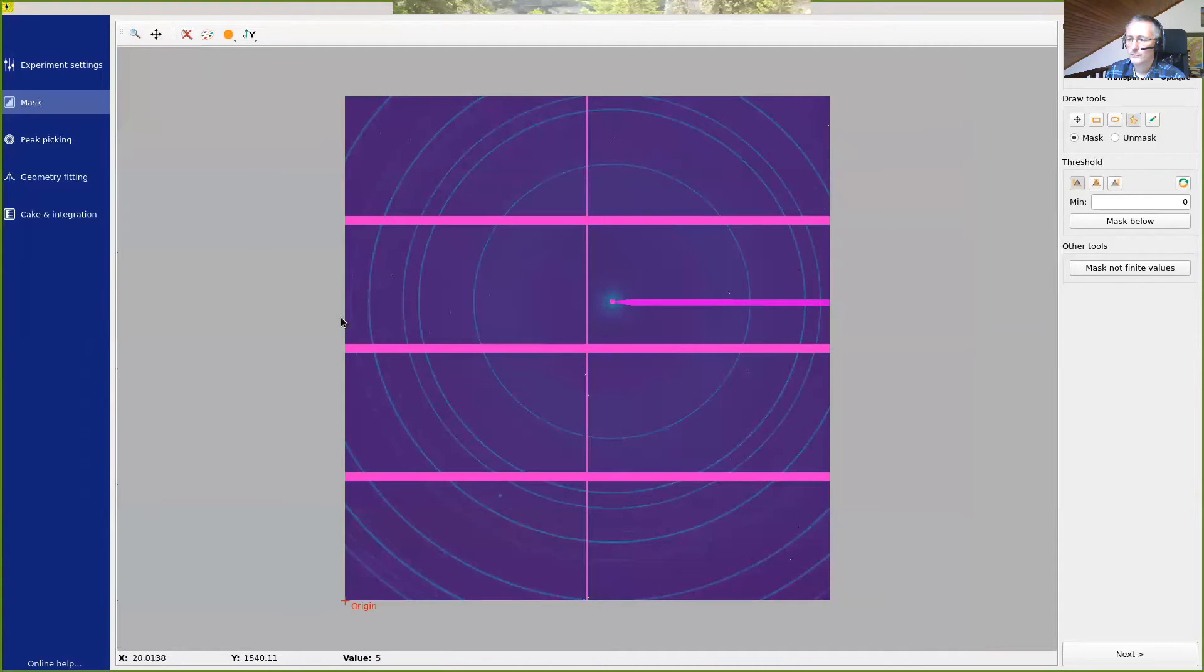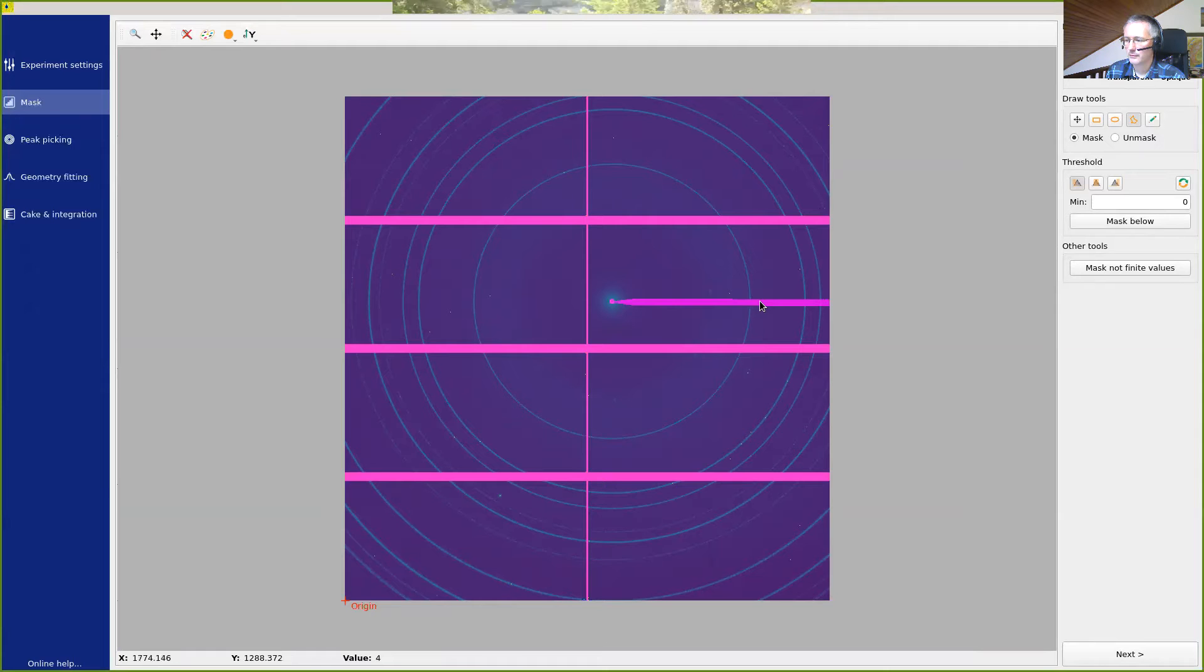So if we zoom back, we have a nice drawing of the beam stop.